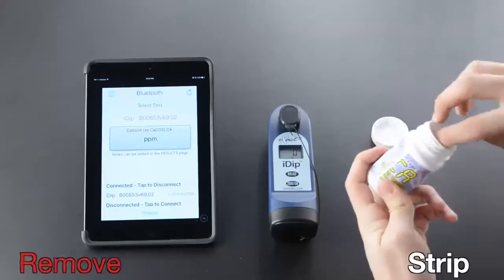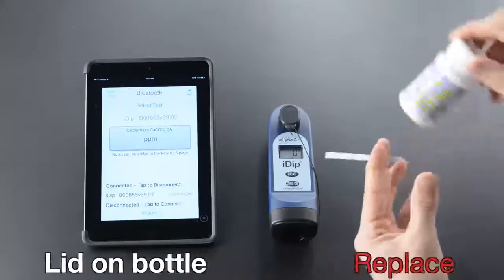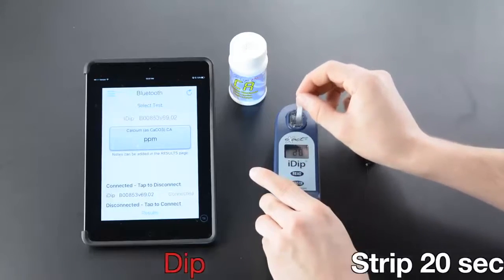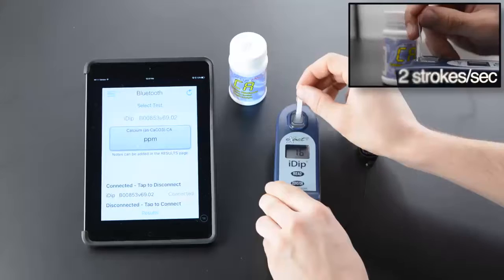Remove the strip and replace the lid on the bottle. Remove the cap, press Read, then dip the strip for 20 seconds at two strokes per second.